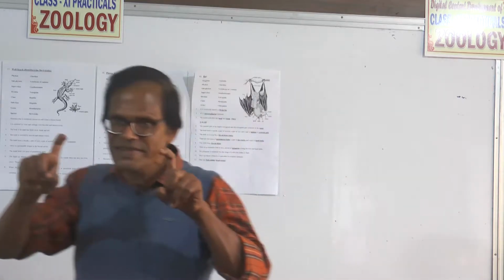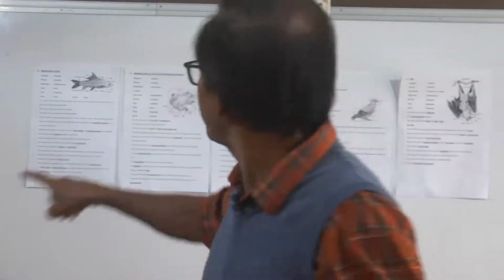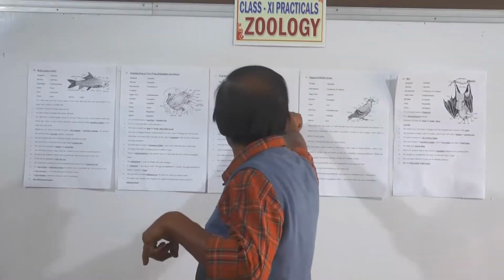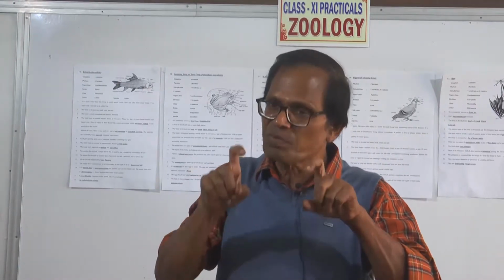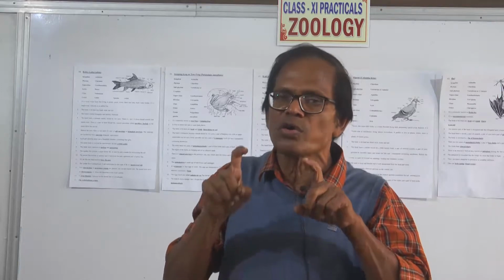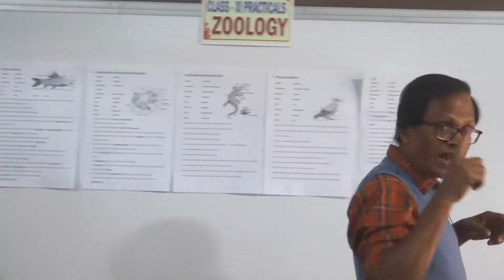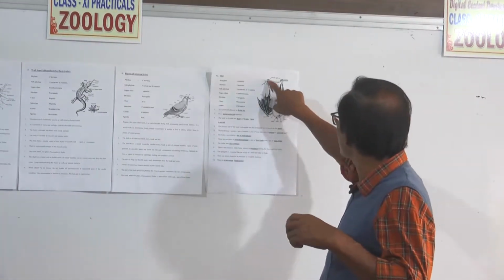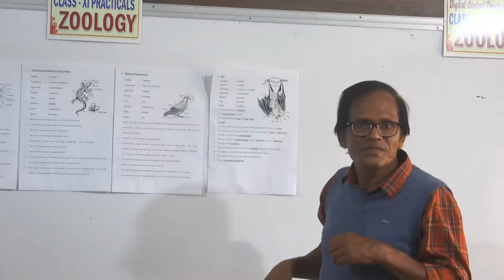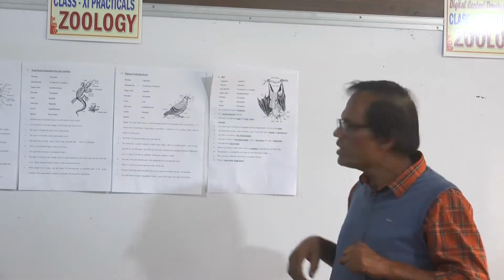Claw means like this. A reptile has clawed digits. Here, in Hemidactylus, you have clawed digits. Spiny structures present on top of the digit. Nail-like structure. Here too, the digits are clawed. Claws are present. What do the claws do?